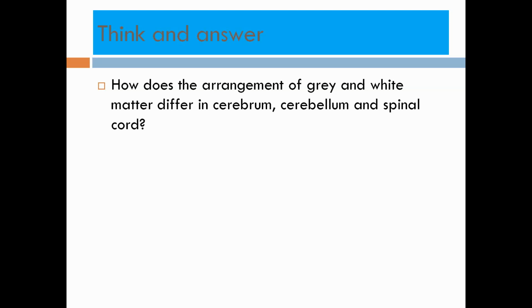Before we proceed, we have a question for you. How does the arrangement of gray and white matter differ in the cerebrum, the cerebellum, and the spinal cord? Pause for a moment, think of an answer, and then press proceed.